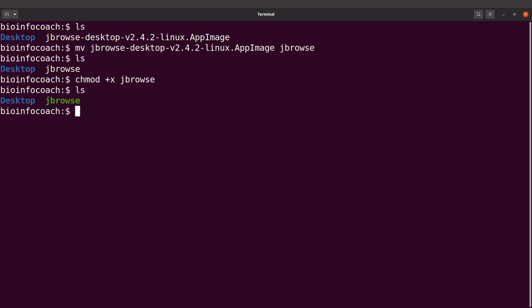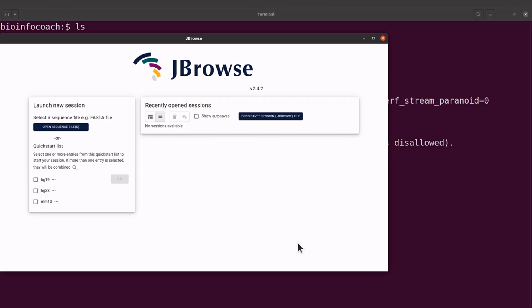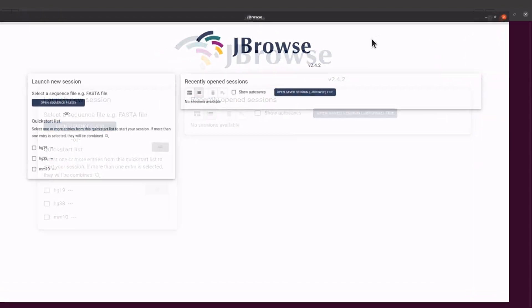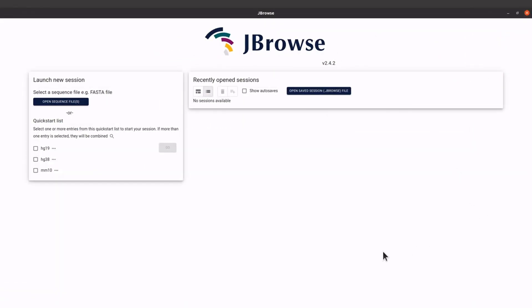Now we are done with that step. To execute JBrowse I'll just say ./jbrowse and execute the command. JBrowse has been opened — you can maximize it. That's how we install and set up JBrowse.